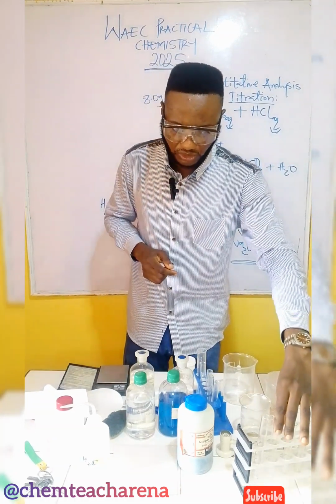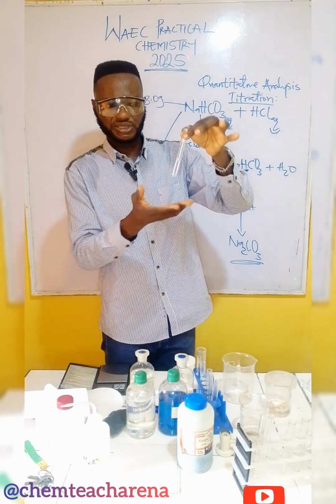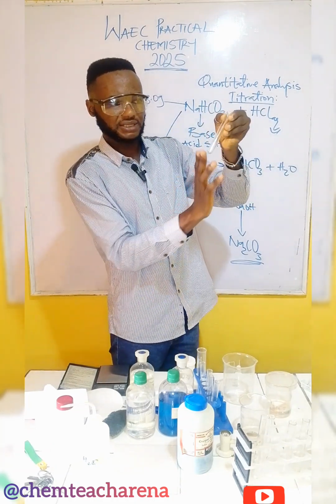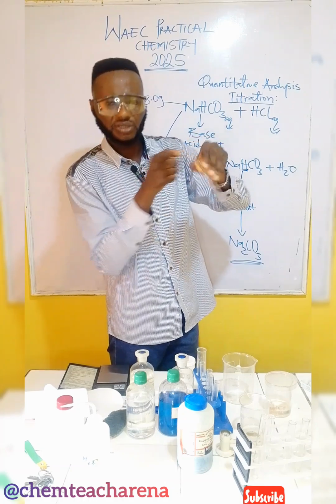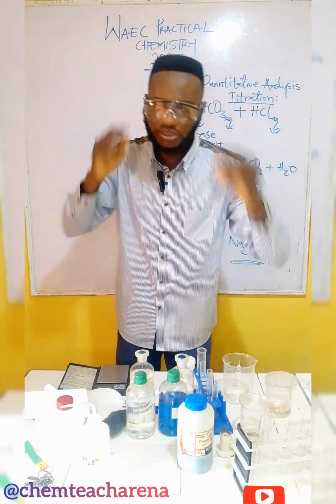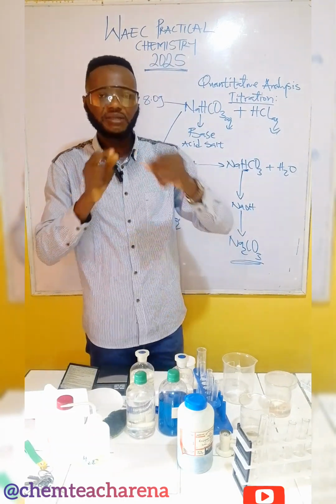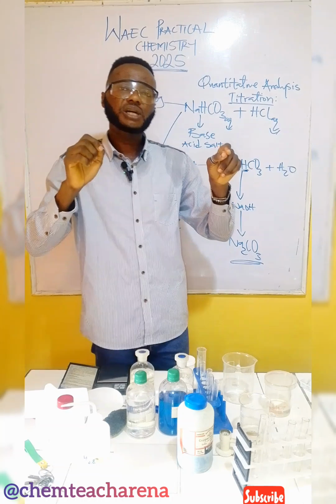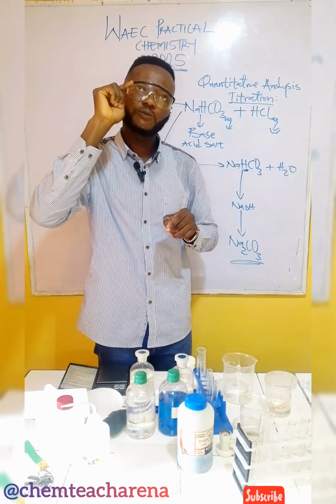It's very small, but this one is just a test tube, but it's just a bit. You will see it. It has height that it can use to stand. You also have a little one where you can fetch. Just a measuring cylinder, but very small like this. It is a 10 mil measuring cylinder. Then you use that 10 mil to measure 8.6. You look at it, you gauge it at 8.6.